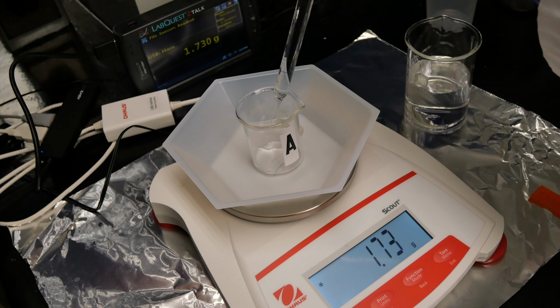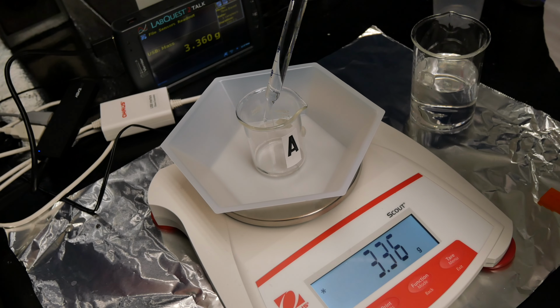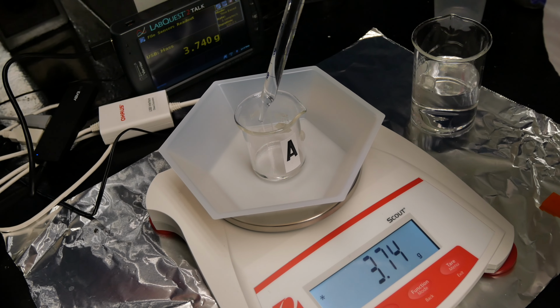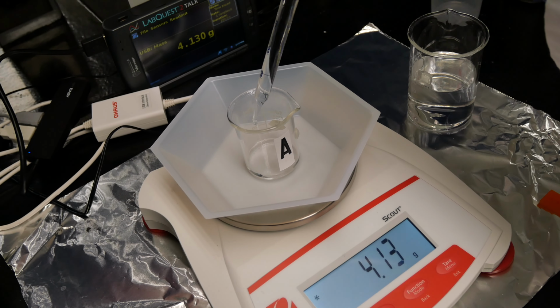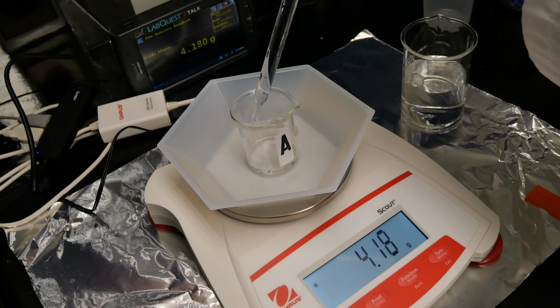Mass 1.730 grams. I'm putting the water into the beaker on the scale. Mass 3.360 grams. I'm listening for 5 grams. Mass 3.740 grams. Mass 4.130 grams.